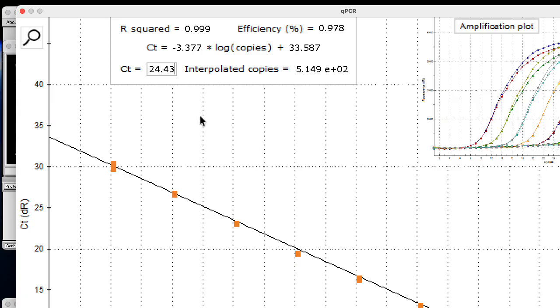And then finally, for Anna at 6 months, if you recall, that was cells B7, B8, and B9. The average for that I calculated as 25.68. Moving that 2 units to the right, that's 219. So at 1 month, there were 1,745 copies. At 3 months, 515. And at 6 months, 219. So the viral load is decreasing over time. Even though those are unrealistically low values for a real HIV infection, this example does show how qPCR can be used to determine viral load.